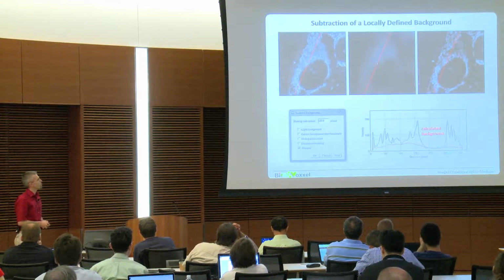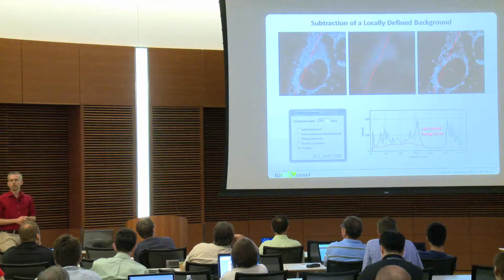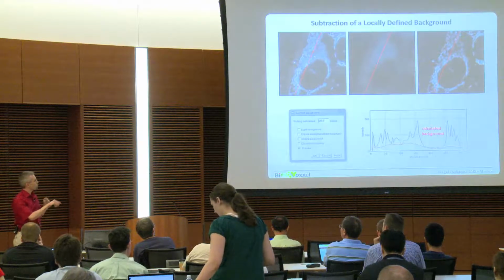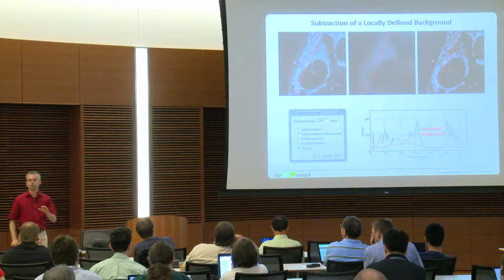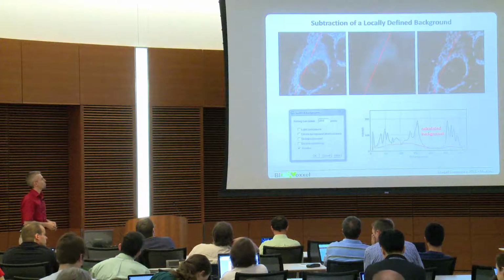Just to mention, you will see that later on, the standard subtract background rolling ball method has a slight problem regarding edge artifacts. You will see that. The alternative is the sliding parabola, which actually has a lower tendency for those kinds of artifacts. That is a little bit better, but also subtracts a little bit lower background.